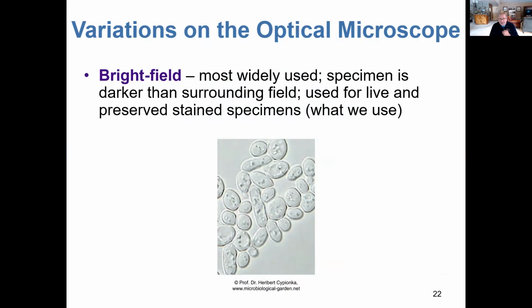So we utilize what's referred to as bright field microscopy. Again, this is basically an artificial light source that beams the light up through the slide, up through the specimen, up into the objective, and ultimately into your eye. And this is generally fine for looking at most specimens, whether they're bacteria, although again, we have to use oil immersion for that.